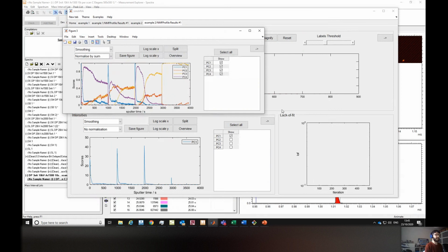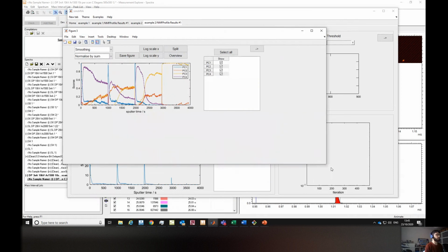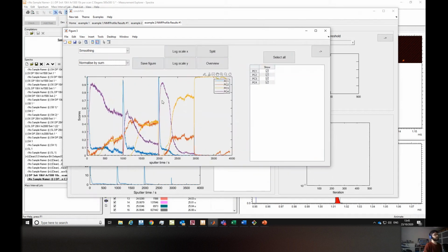And that's why it's a very useful tool to use, this kind of consistent processing to help you understand, because you have so many peaks, you don't know which ones are related. So once you do this, you can go back and start looking at the chemistry. And obviously, this is tough data. With Orbi data, it's even more complex, right? You have so many peaks and this huge dynamic range, so you don't know which ones are actually relevant for you. So once you do this kind of analysis, it may help you to go back and look at the things of relevance for you.